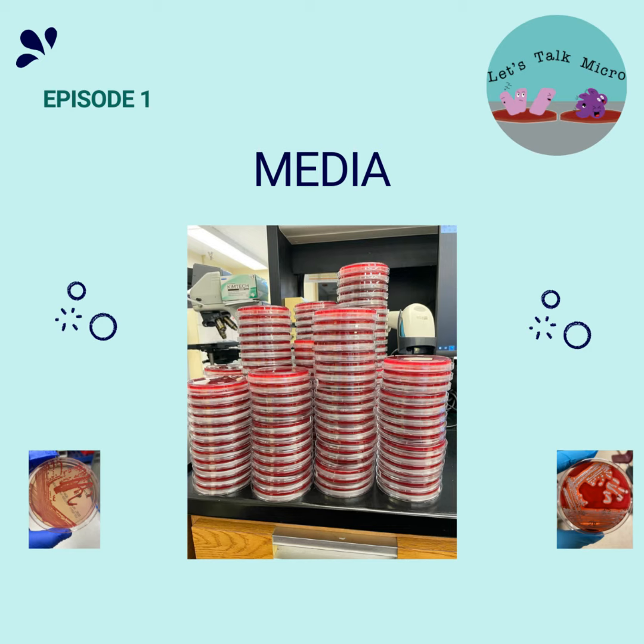So what I mean, for example, if I give you a test and I say, what kind of media is MacConkey, right? And your answer is selects for gram negative. Okay? So gram negative what? You see? By leaving it like that, you are telling me that I can go ahead and put a Neisseria gonorrhoeae, a Pasteurella, a Haemophilus, and it will actually grow.